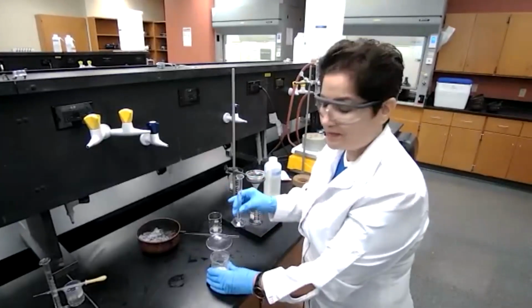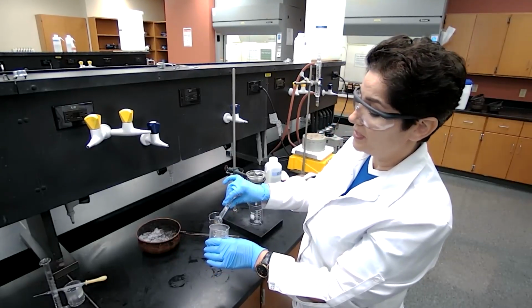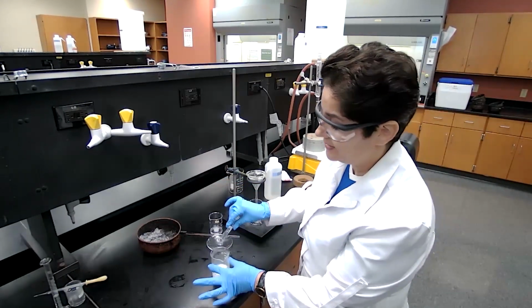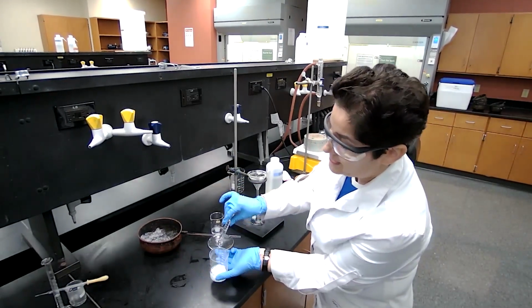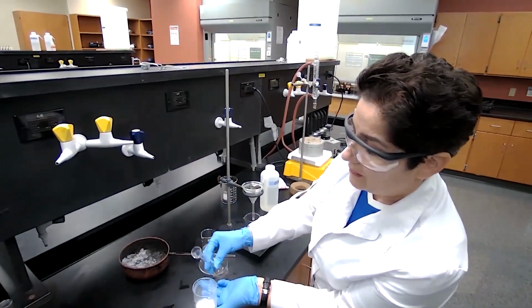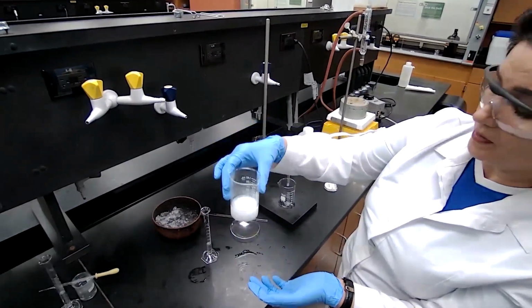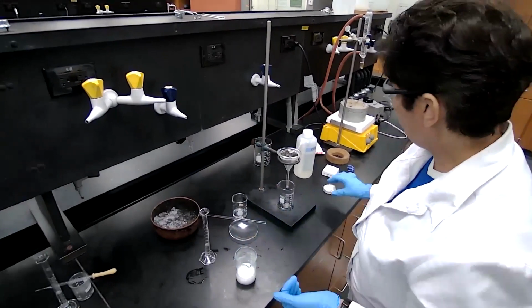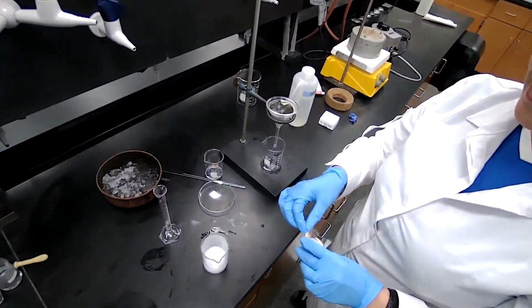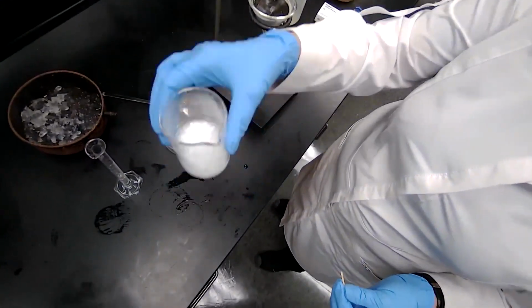After the gravity filtration is complete, we are going to add 10 milliliters of the 6 molar hydrochloric acid. And you see that as I'm adding, the white precipitate is forming. This is in the acidic solution; the benzoic acid that's formed is insoluble.